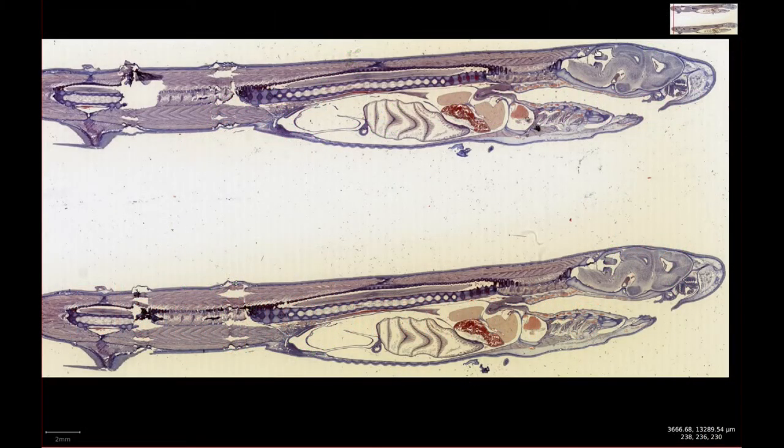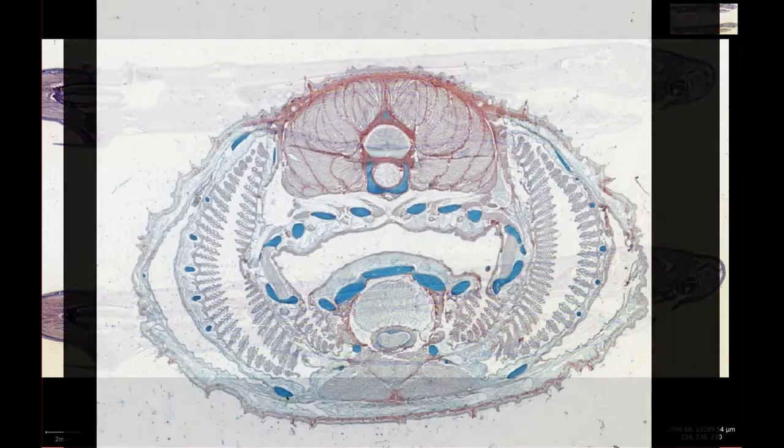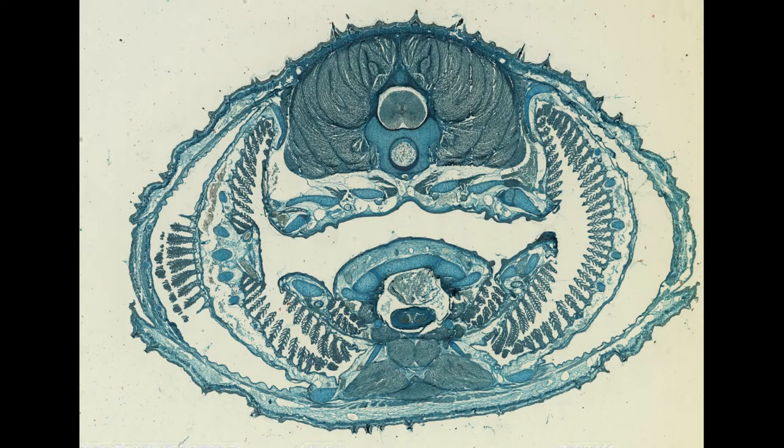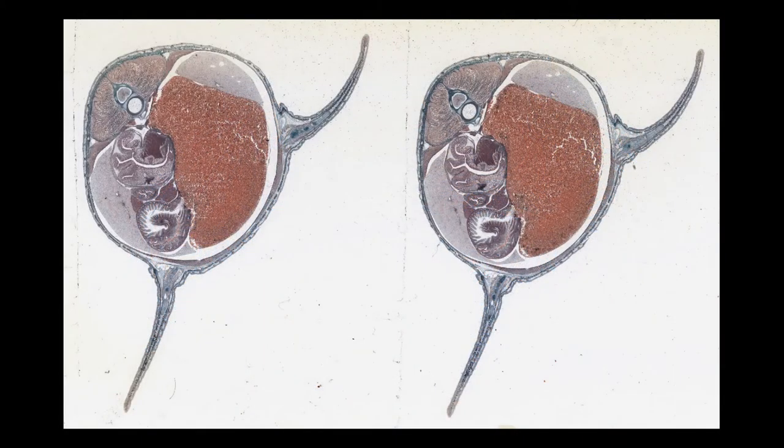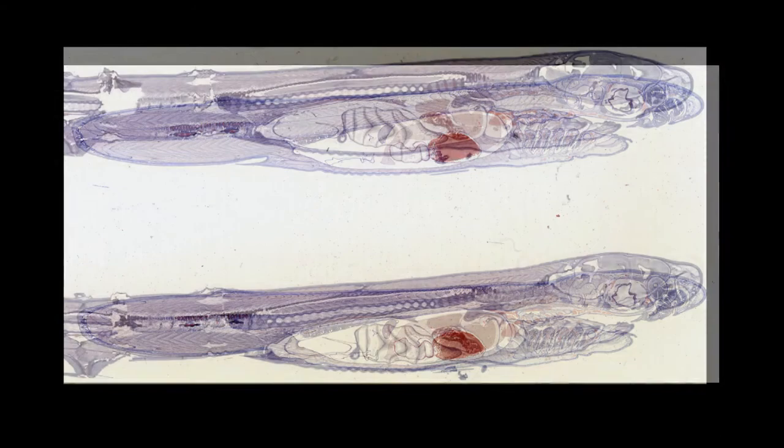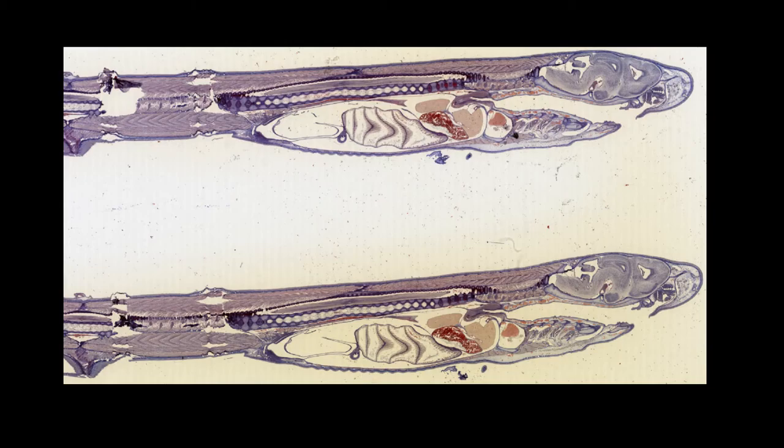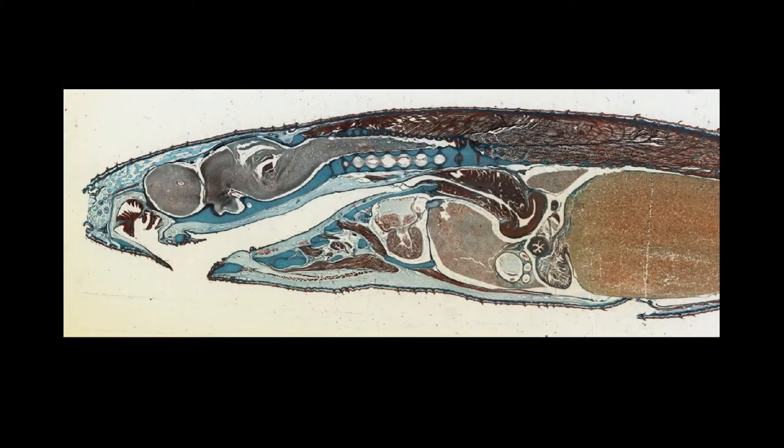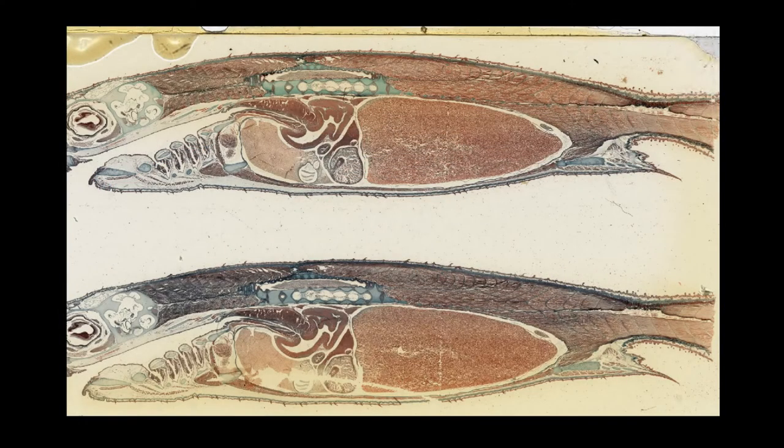Within the slide collection there are eight dogfish slides: three transverse sections, two through the gills and one through the more caudal coelom or body cavity. The remaining five are longitudinal sections through different parts of the dogfish. Given that the whole dogfish fits on a microscope slide, these are likely very young specimens which are still developing. First off, let's work out where each of these sections has come from.